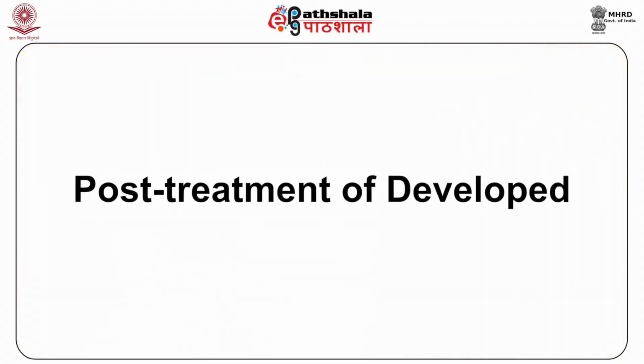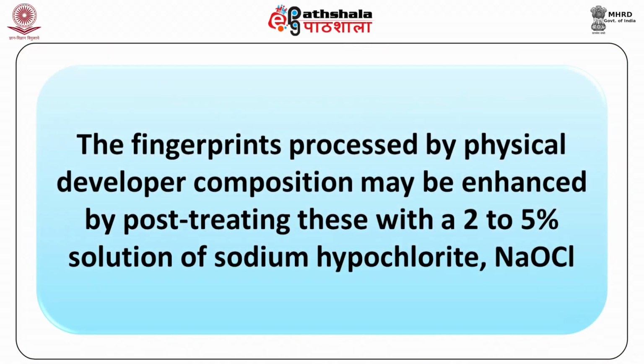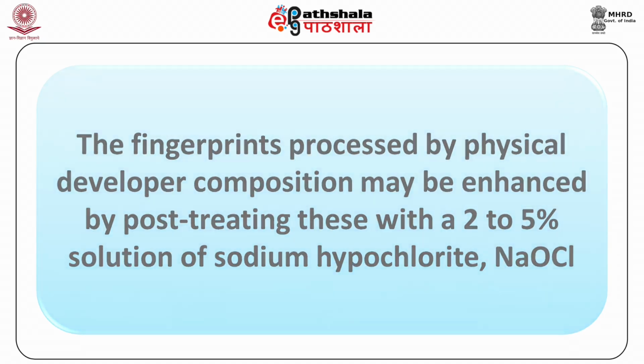Now, let us see the post treatment of developed prints. The fingerprints processed by physical developer composition may be enhanced by post treating these with a 2 to 5% solution of sodium hypochlorite, which is also known as NaOCl.